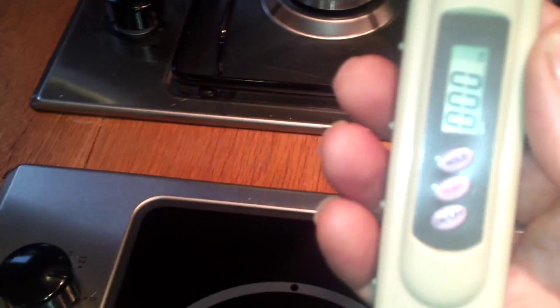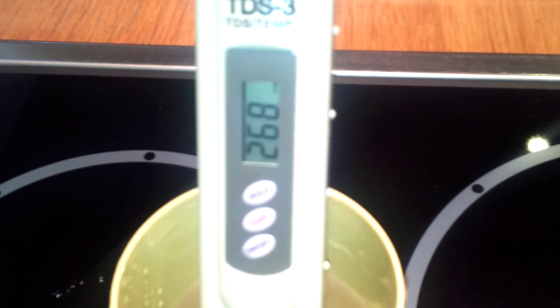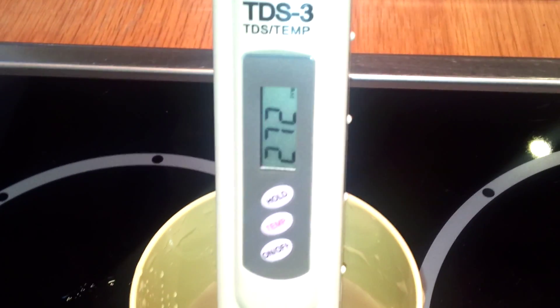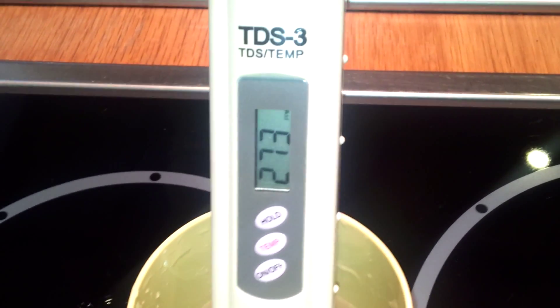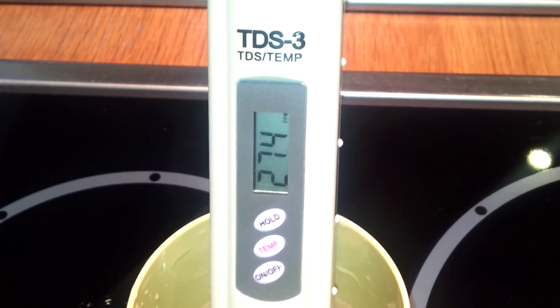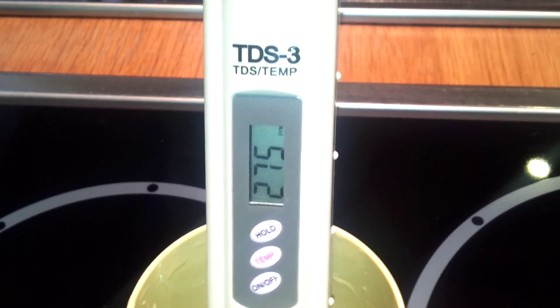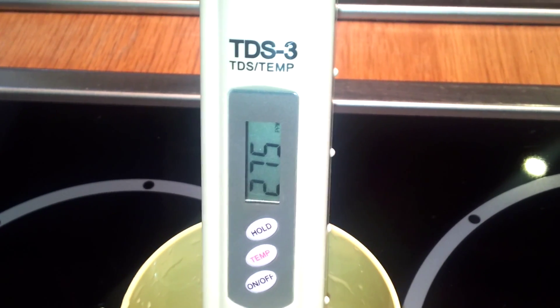That's it — we're on zero until we put the machine in the water, and then we're getting a count straight away. So this is tap water, levelling around 275. Let's see if it goes a bit higher. Seems to be fairly stable at 275.